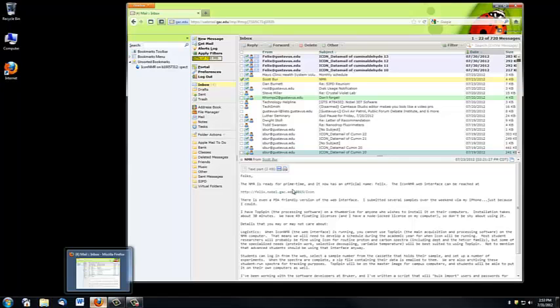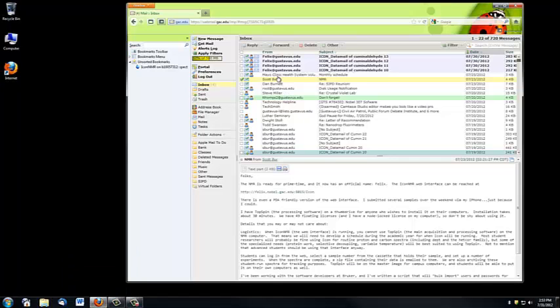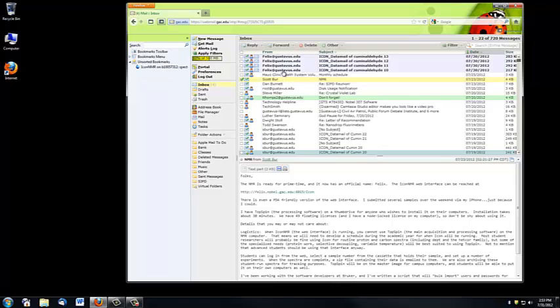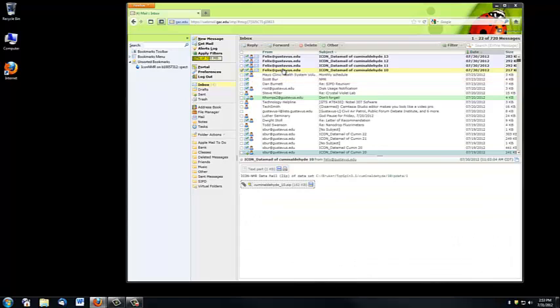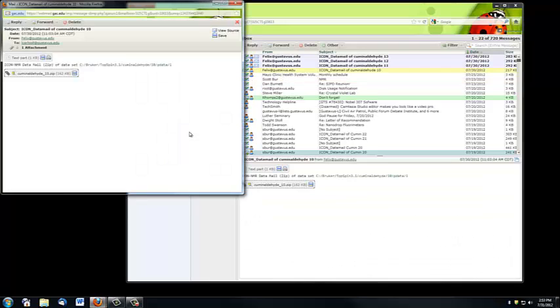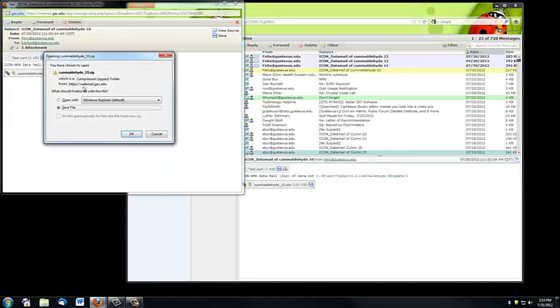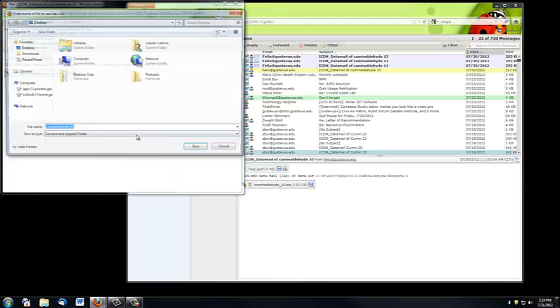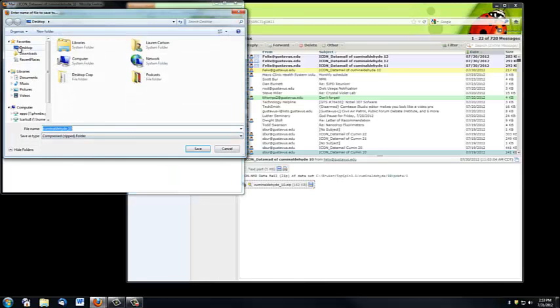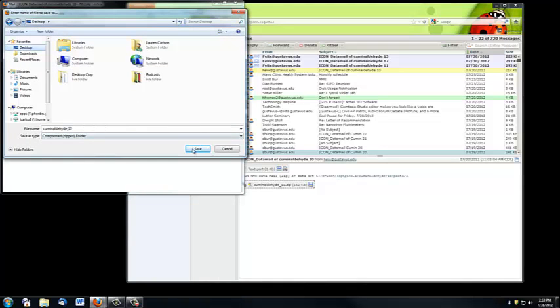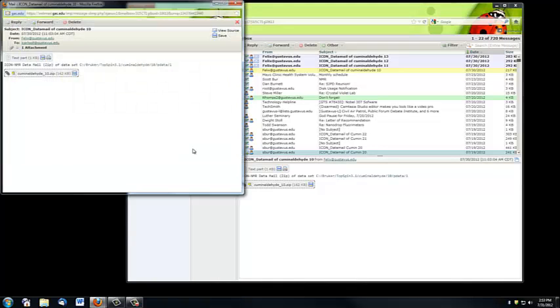When I open my email, I see a series of messages from Felix at Gustavus.edu. These are automated messages sent from the NMR. If I click on this message here and save the file, I prefer to save these to the desktop so they're easy to find later.